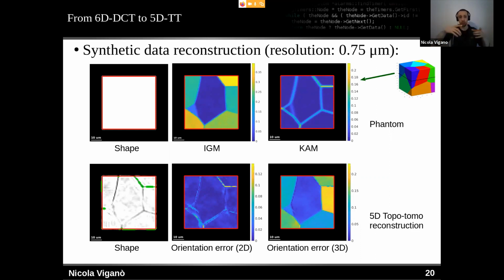Here we have a simple square grain where basically we have obviously some misorientation inside. I think it was 1 degree misorientation total. And we can see that we have some local crystals, say sub-grains, inside of this grain.